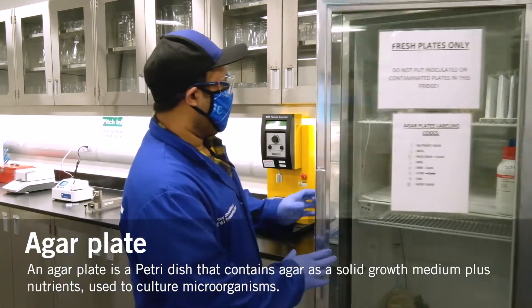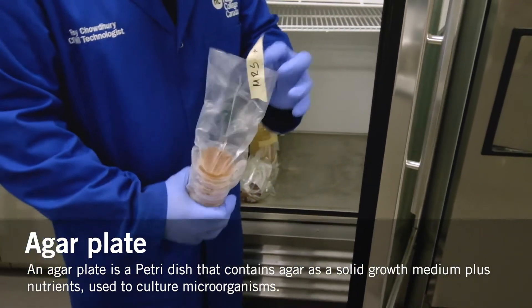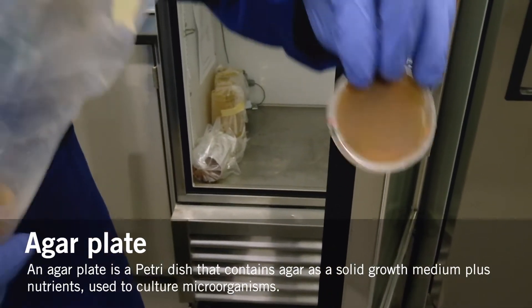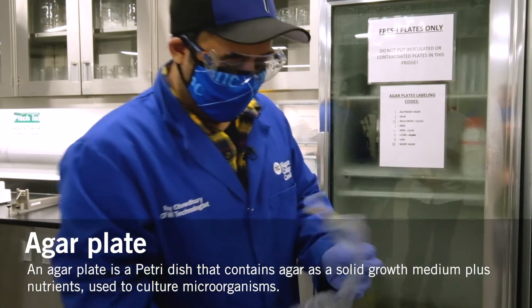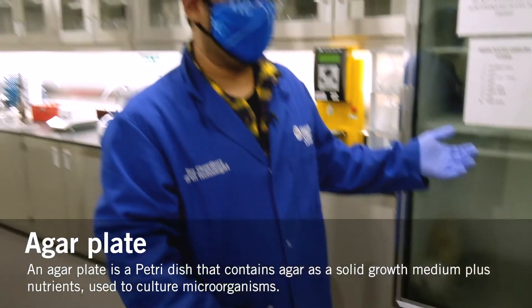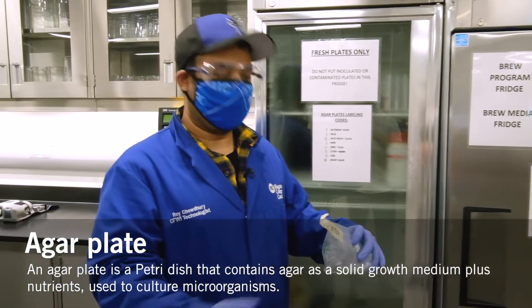This is the media fridge. As you can see, there are plates which haven't been streaked yet. This is the MRS plate — this is typically what our plates look like with no colonies grown, meaning it's a clean plate ready for use. This is the WLN plate, which is a different color because it has different kinds of ingredients present in it. It also grows different microorganisms because they need different kinds of nutrition. As I mentioned earlier on the chart, different organisms have different growth media so they can grow and remain viable.